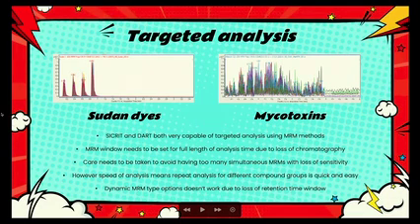If you've got familiarity with things like dynamic MRMs, where it'll update retention time to cope with small changes in your chromatography, that sort of stuff doesn't work with AIMS and DIMS. And my colleagues Vera and Nicolas will talk about the challenges that come from not having retention time. But safe to say quite a lot of vendor-specific software really doesn't like not having different ions coming out at different retention times.